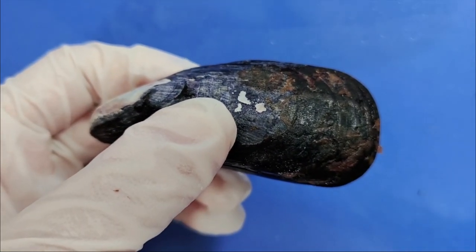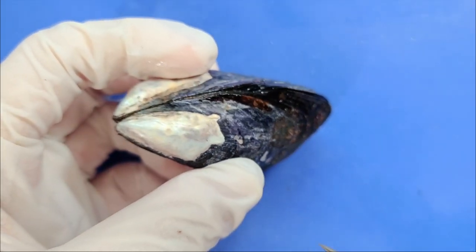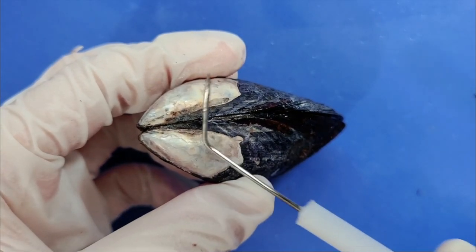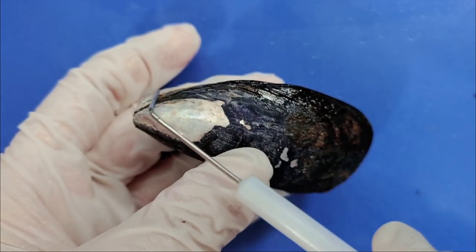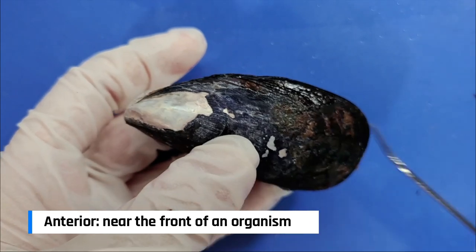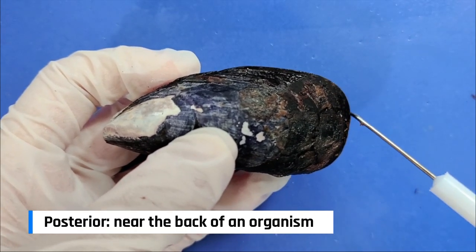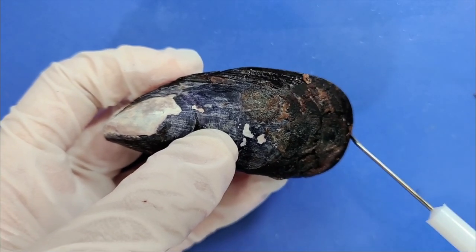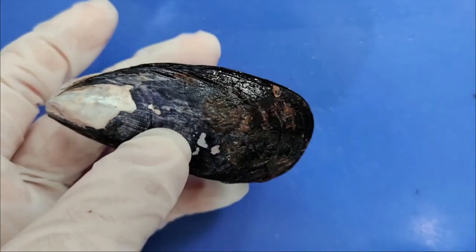By this, I mean that when the mussel sticks itself in the sand, the hinge will be the part that pokes out. Now if you look at this side, the pointy end is the anterior side, meaning the front, and the rounder end is the posterior side, meaning the back. This means that when the mussel moves, it'll move in the direction of the anterior side, like this.